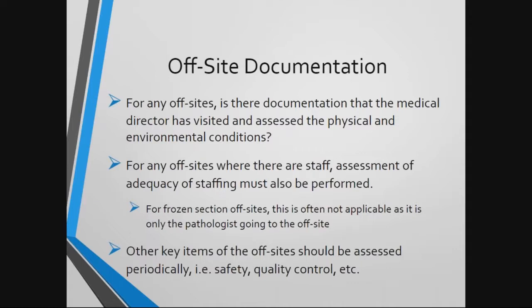Facilities located away from the main lab that hold a certificate of accreditation are required to have oversight documented when the medical director is not primarily positioned or regularly present at this site. In AP, this is necessary if you have offsite frozen section facilities. Medical directors are required to have documentation that shows that the offsite is visited and assessed on a predetermined basis.